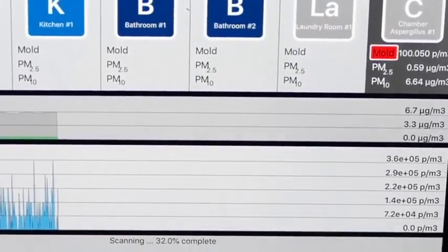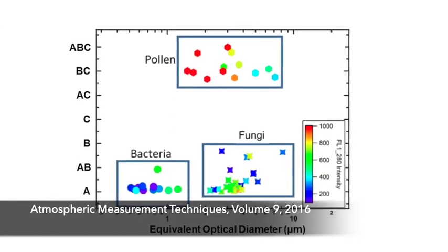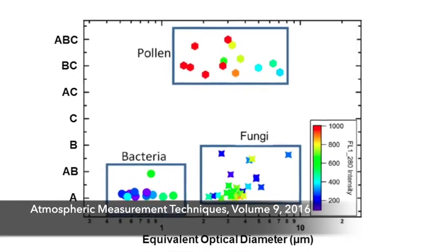Having done microscopy for almost my entire academic career, I was really excited by the prospect of a mechanized microscope, an instant microscope, where the name comes from. Nobody knows the inventory of airborne microbes in the world, and this allows us to count, size, and at least identify to a coarse level bacteria, pollen, and fungi in near real time.